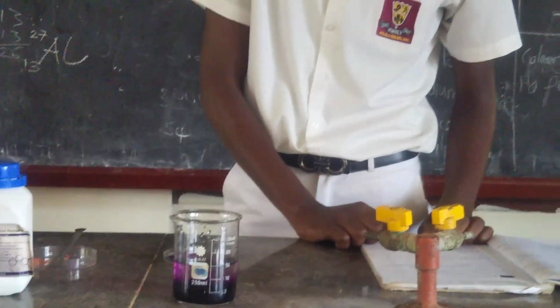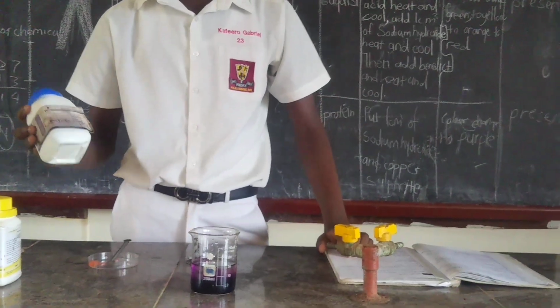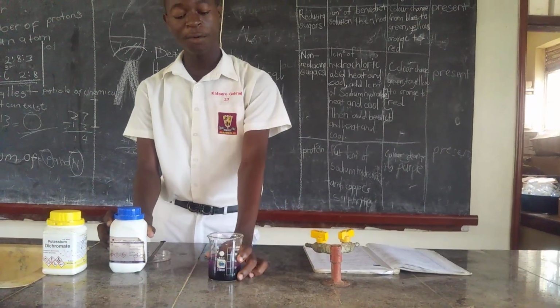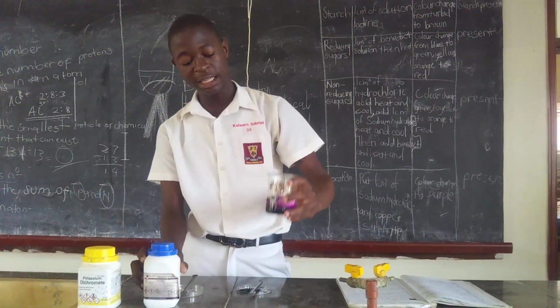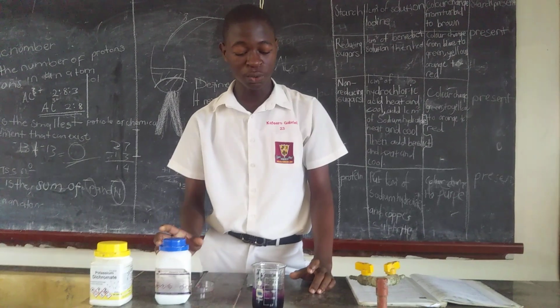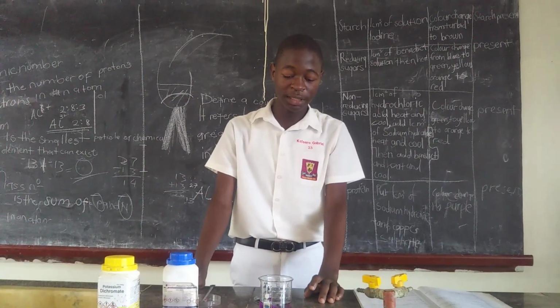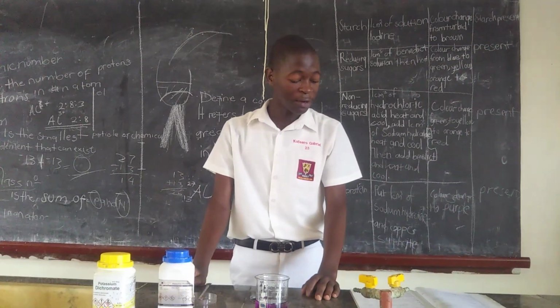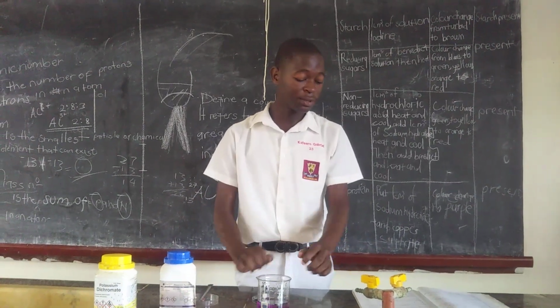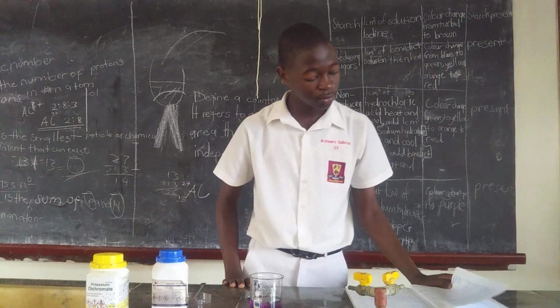So our third step says, swirl the beaker slightly and leave it to stand. As you see here, this is after adding this potassium permanganate to the beaker containing the water. So it gave us this result. They are saying slightly leave it on a flat surface for it to concentrate. So as I've done it, I will need to leave it for a few minutes. Then I will see our results, so that we can get an accurate practical work.